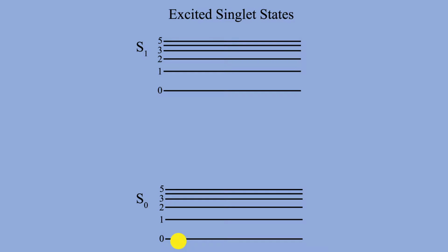The diagram describes the fluorescent molecule as sitting in a ground state. Excitation energy, a photon, excites the molecule to a higher energy state. A series of non-radiative internal conversion and vibrational relaxation can happen in these excited states. When the molecule relaxes to the lowest energy level of the excited state, the molecule returns to the ground state. Energy is released as a photon for fluorescence to occur. However, it is noted that non-radiative relaxation may also happen and no fluorescence observed.